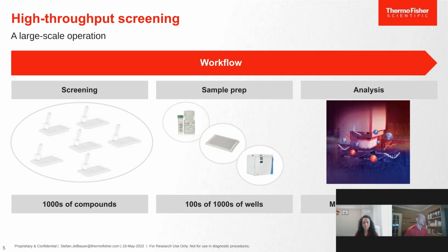As part of the analysis, a data analysis tool and platform is also needed, and this is something that's sometimes overlooked, but I want to stress the importance of this as well. In order to reduce the time to results and to increase the efficiency of your high throughput screen, many labs are looking into automating several steps or the whole workflow, and we'll present some solutions here today to do this with two particular assays.